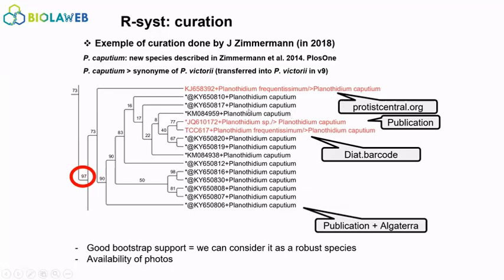That's basically the work we are doing to manage to have a homogeneous taxonomy for each clade in Diatom. It's really step by step, but to reach something correct. There are still some mistakes for sure, and if there are people ready to help, please, no problem, come.